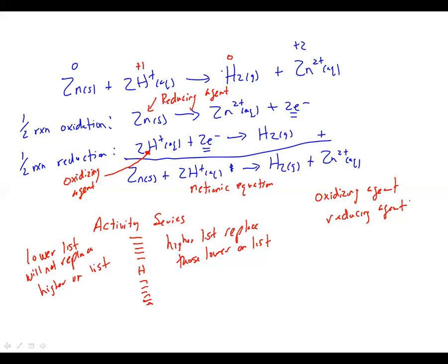for the oxidizing agent. So based on your observations in part 1, you're going to want to look and see, okay, this one went through an oxidation reaction this many times, this one went through it this many, and you could put them in order. So I almost tend to think perhaps they have you put it in order based on either reducing agent or oxidizing agent. That's essentially part one's experiment. Any questions on that?